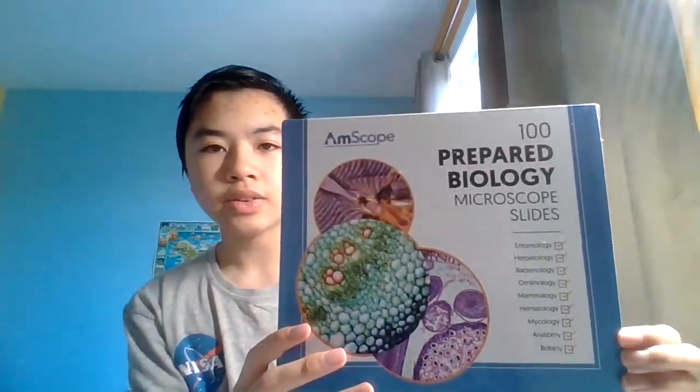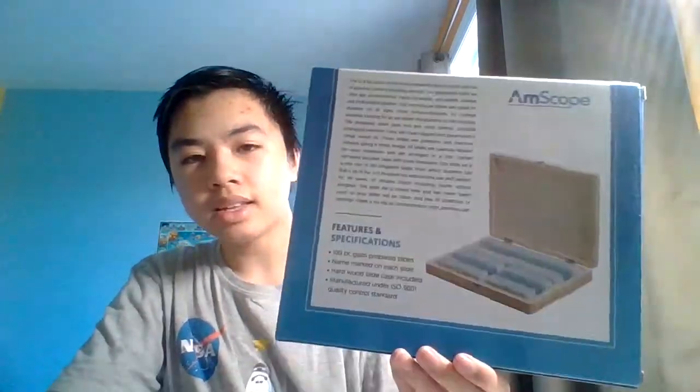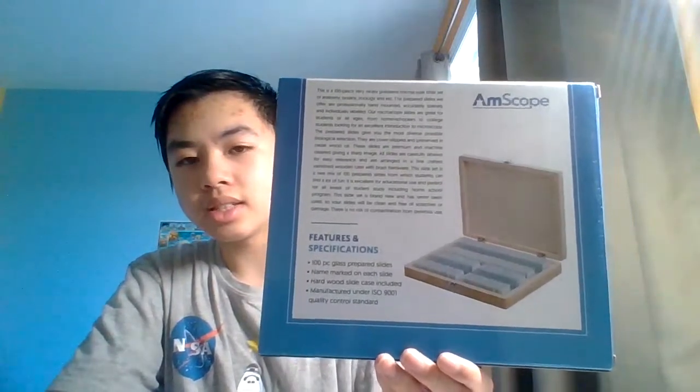So this is what the box looks like. Over here, there's different kinds of biology from different branches of science that you can look at. And this is what the back of the box looks like.